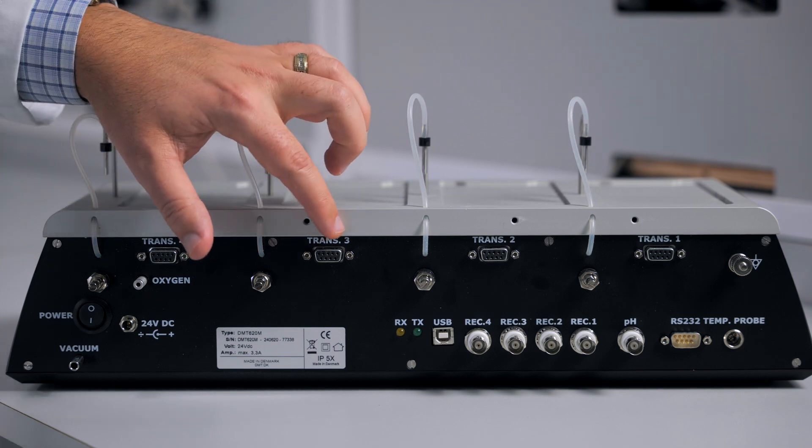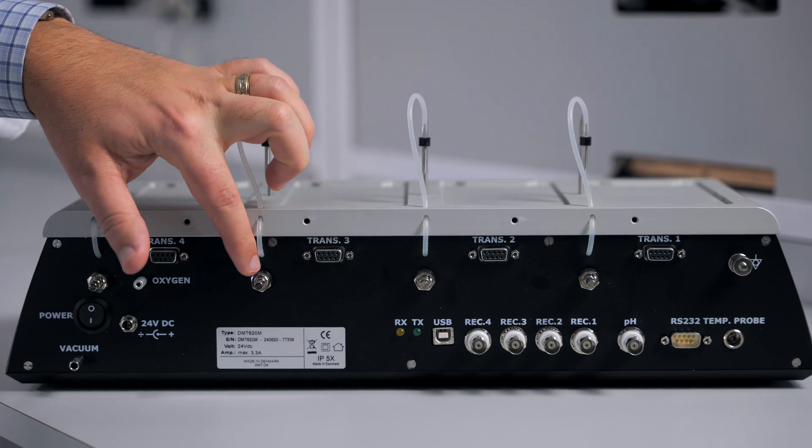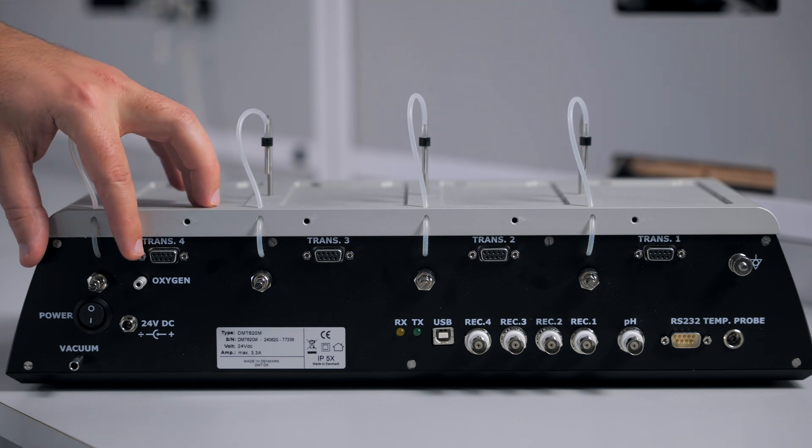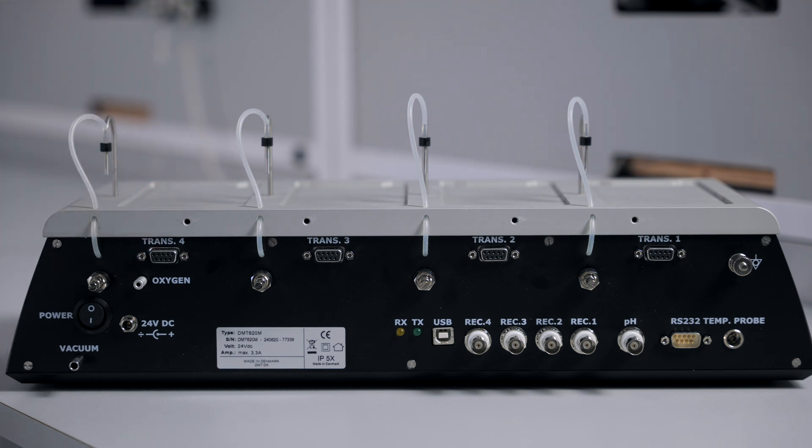Each channel will have a connection for a transducer, as well as a needle valve to control the amount of bubbling in each chamber. You have your connection for the power source, as well as your power switch. This is your connection for the vacuum source. You have a port to connect to a gas tank for bubbling your chambers.